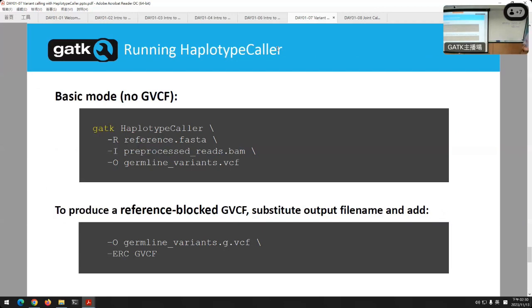And because this is the first time we're doing this, I'll take just a second to show you that the GATK has different arguments. So -R means the reference file. Mostly with the GATK, you'll want to provide a reference because all the reads are aligned relative to the reference, so we need to actually use it in all of our analyses. -I is the input BAM, and -O is the output VCF. Pretty simple, okay? Reference, input BAM, output VCF.